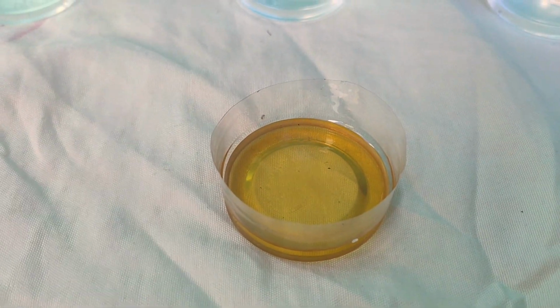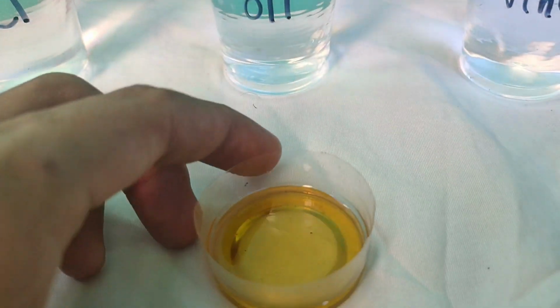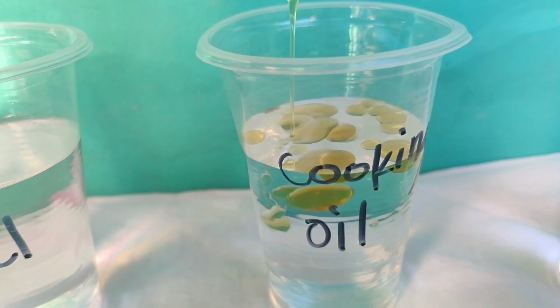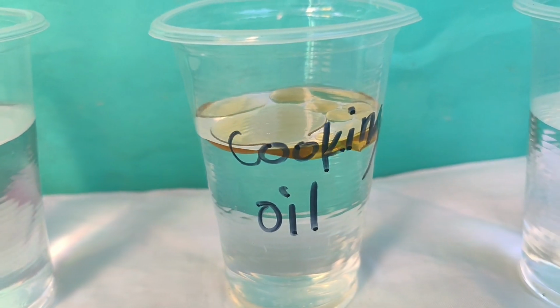And now is the cooking oil. I put at least 1 tablespoon of cooking oil. We can see here already that the cooking oil is floating.